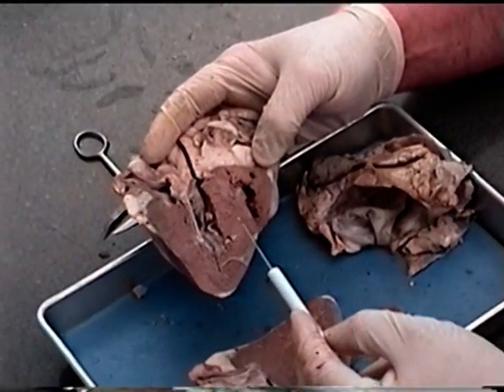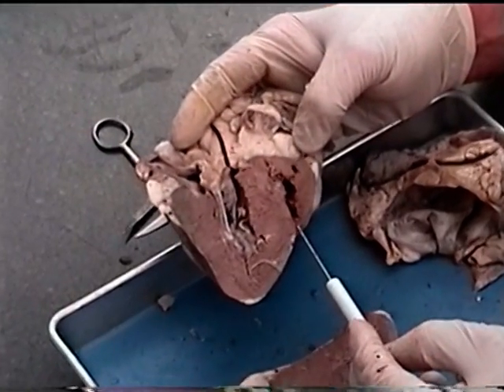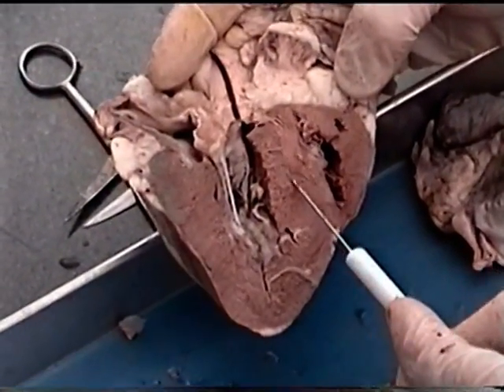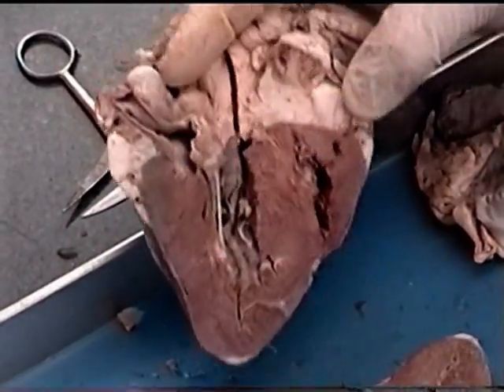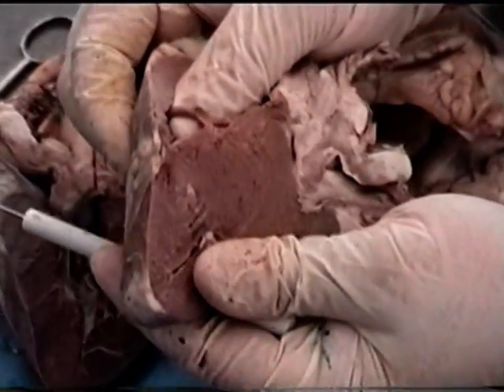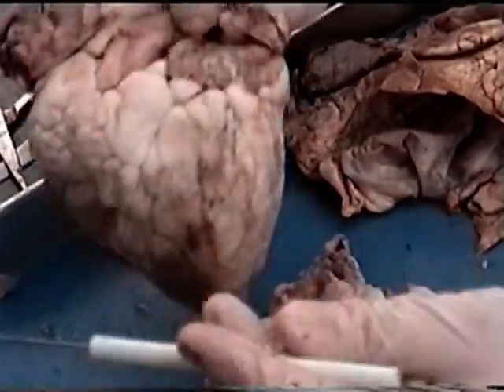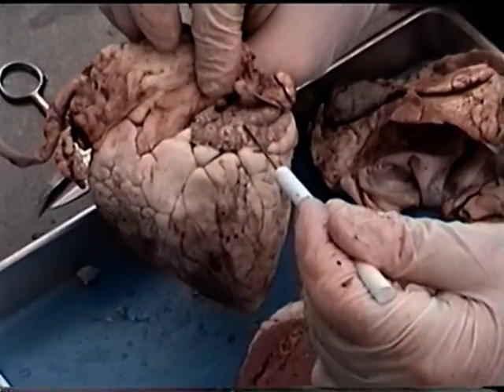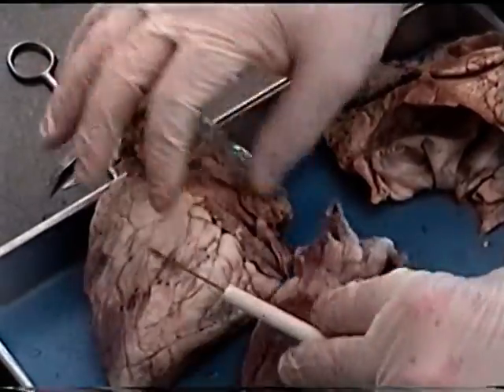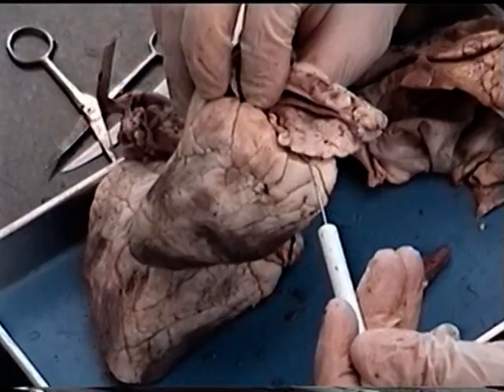So just as a quick review, what we're seeing here is the right ventricle. We can see that the right ventricle is really thin here. The interventricular septum and the left ventricle over here. Remember on the right side, because it's so thin, we have a moderator band that prevents this from being blown out. At the top of the heart we have a left atrium with an auricle on this side, and then when we look at this side we would have a right atrium with an auricle on this side.